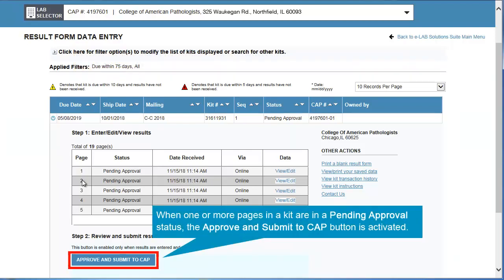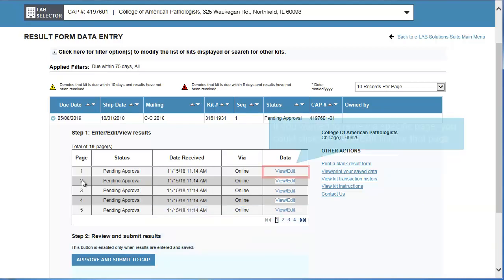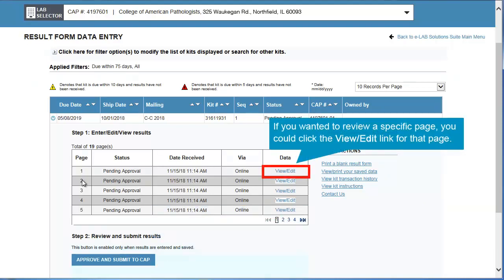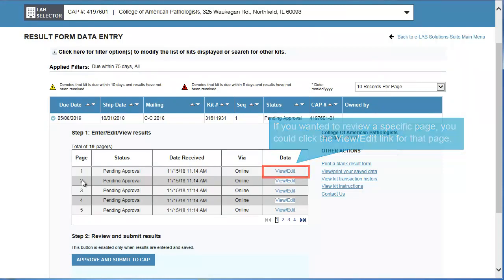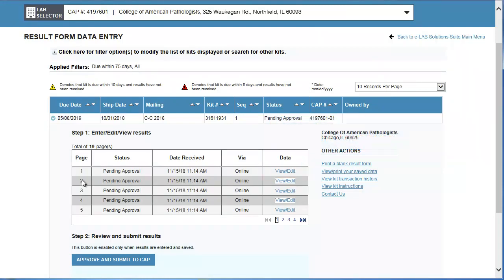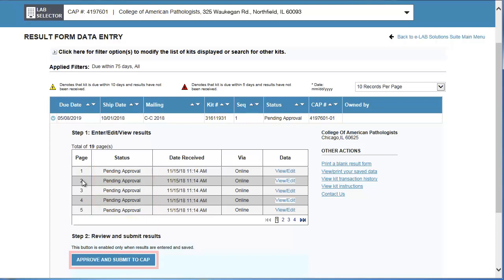When one or more pages in a kit are in a Pending Approval status, the Approve and Submit to CAP button is activated. You would click this button to review and approve all pending pages. If you wanted to review a specific page, you would click the View Edit link for that page. For this example, assume all the pages for which you transmitted data are now pending approval and that you want to review and approve them. Click the Approve and Submit to CAP button.